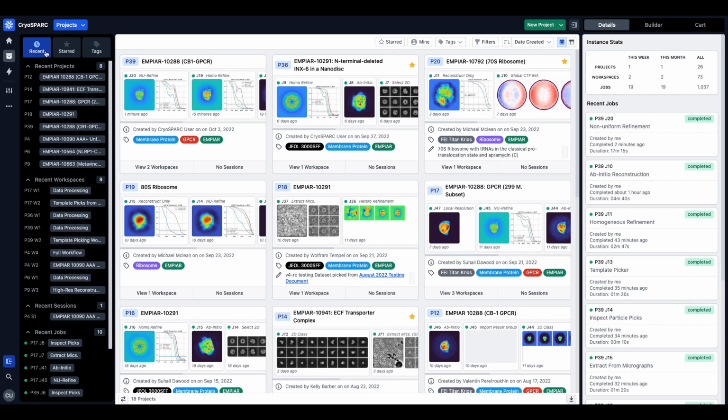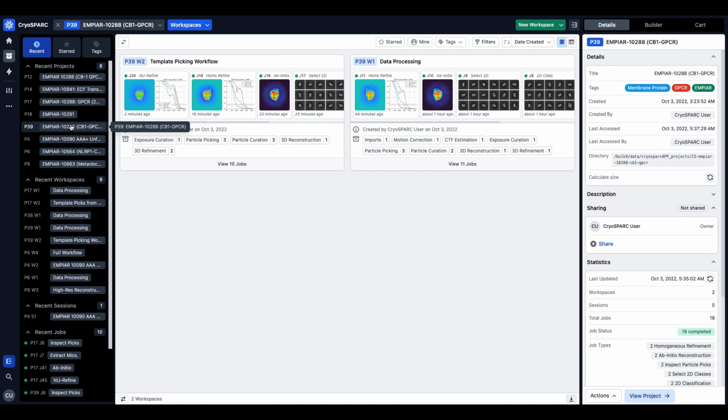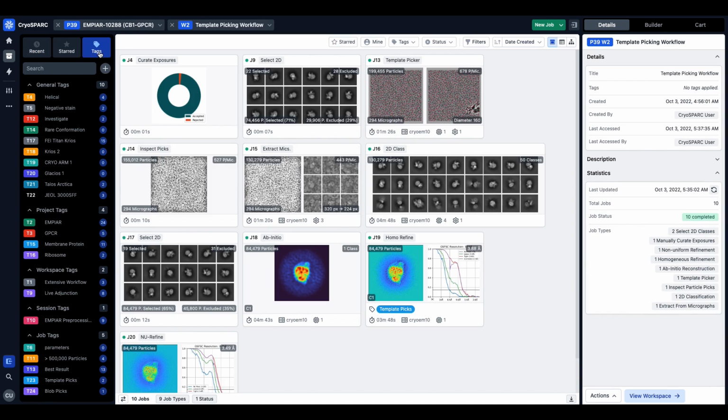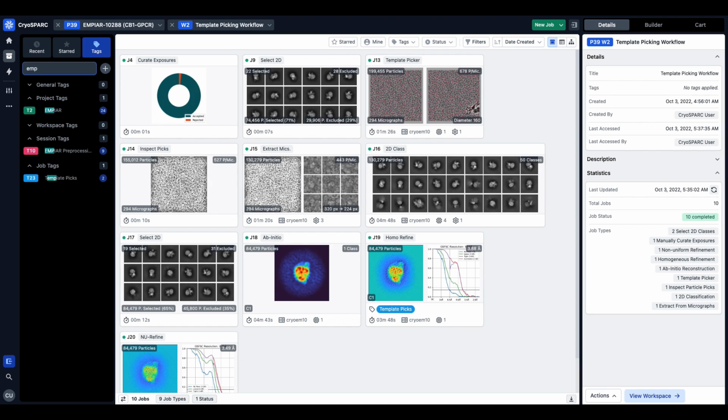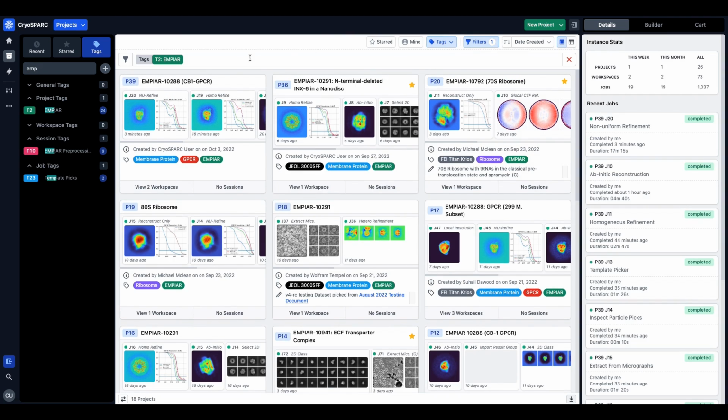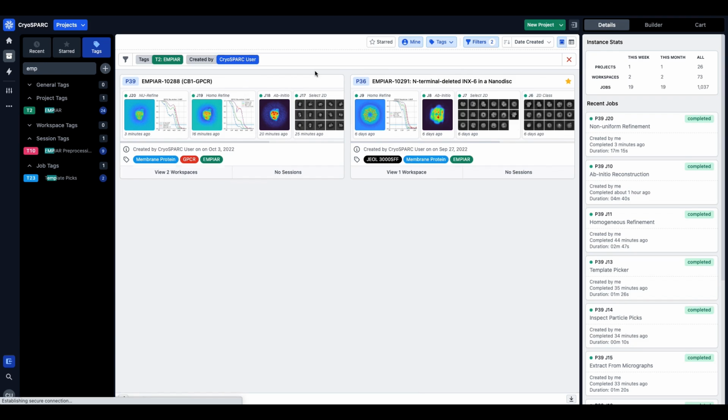Since it can be opened on any page, the Quick Access panel is an easy way of navigating around several pages of interest. You can toggle it by clicking on the button at the bottom left-hand corner of the screen, or using the keyboard shortcut Command semicolon. When you navigate to a view from the tags on the Quick Access panel, the Browse control bar highlights, denoting a filter has been applied. You can click on the Filters button to open up the filter bar and further refine this view. The filter bar is accessible on every browse view and synchronizes with the web browser URL. This means you can easily bookmark the tab for reference or share it with another user so they may view the same data.